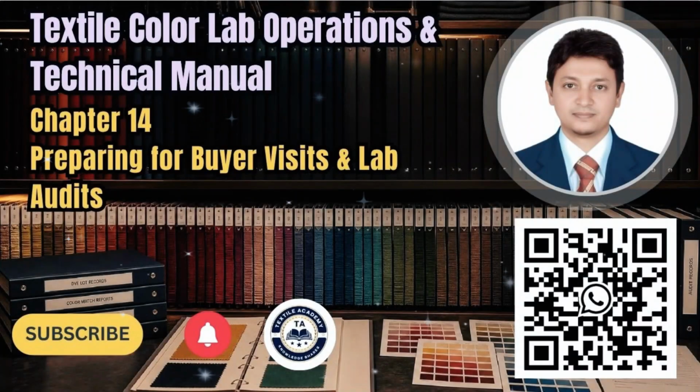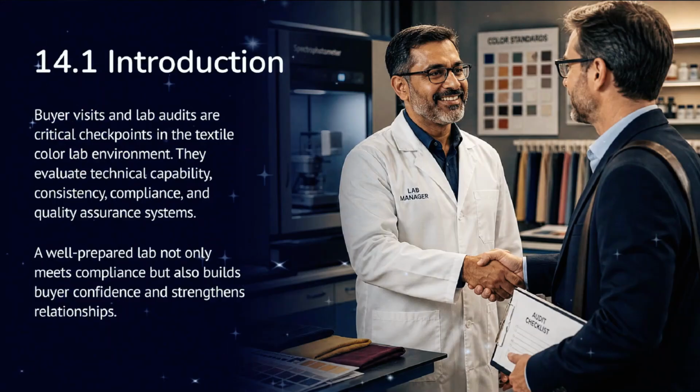Welcome everyone. In this session, we will focus on Chapter 14, preparing for buyer visits and lab audits. This video outlines the essential steps for maintaining a high-performance textile color lab that is always ready for evaluation. Buyer visits and lab audits are critical checkpoints in a textile lab.